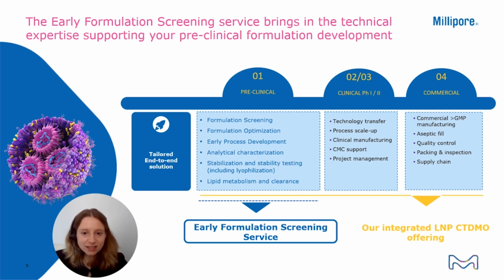Last and very crucial is the analytical characterization of the LNP. LNP formulations, as you have seen, are very complex formulations, so you need to have suitable analytical tools in hand to characterize that formulation to ensure a high quality of your product. And this is where we have also put a strong emphasis on having a broad variety of different analytical tools for characterizing LNPs. And that's why it fitted very well that we got the opportunity to test the CloudSpec instruments in our lab to investigate if that's a suitable technology that we can add to our analytical portfolio.